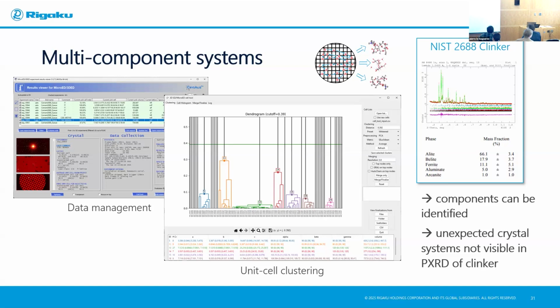Thank you. There's a lot of data in the electron diffraction history that error bars are incredibly important, and you can't actually make the same assumptions as people make for X-ray diffraction. Have you thought about including the error bar analysis based upon your repeat measurements in what you provide to users, and chi-squared refinement? Because chi-squared and R1 can often be very different with electron diffraction data.